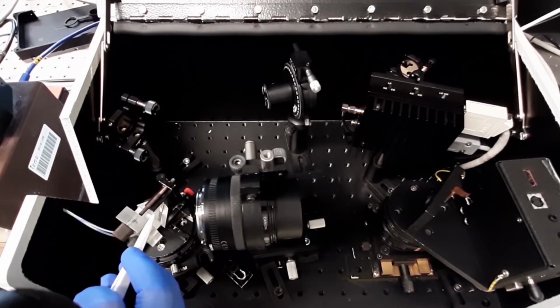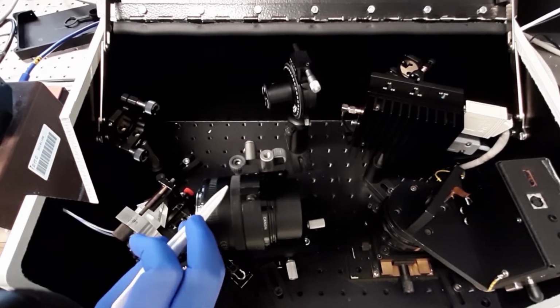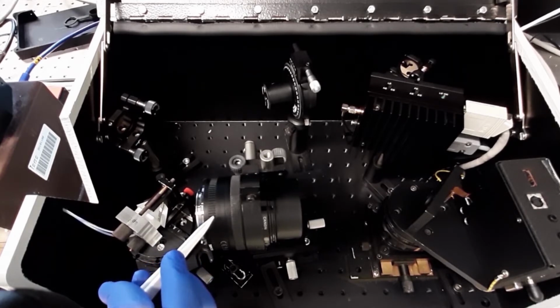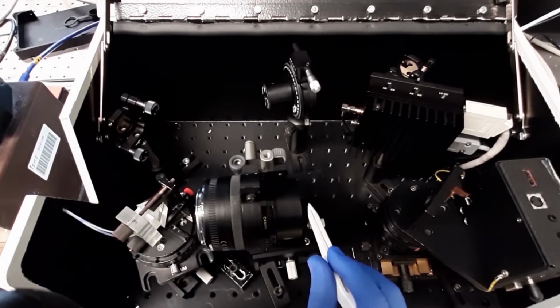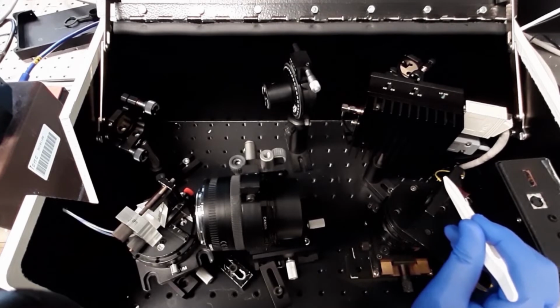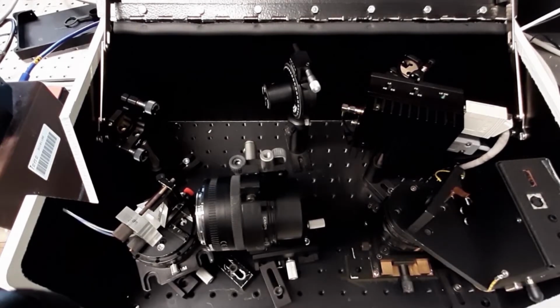The reflected light passes through the objective, which is located over here, and this is a normal photo objective, and further the reflected light can be captured by a CCD camera. As you may see, the PAMONO-sensor is a rather simple and portable instrument.